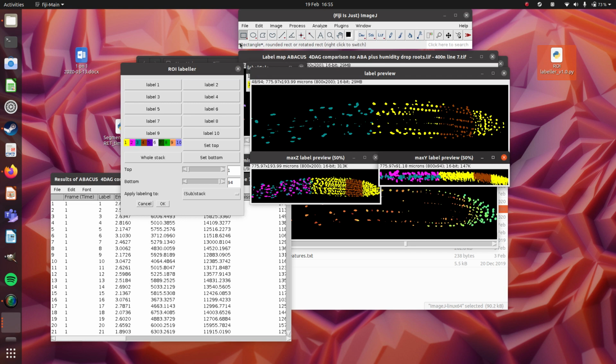Nice and easy. You can also use the line tool. So if you double click the line tool, you should be able to alter the width of it. If you alter it to about 20 and then right click it, you can select freehand line, you should be able to then just draw on your image.